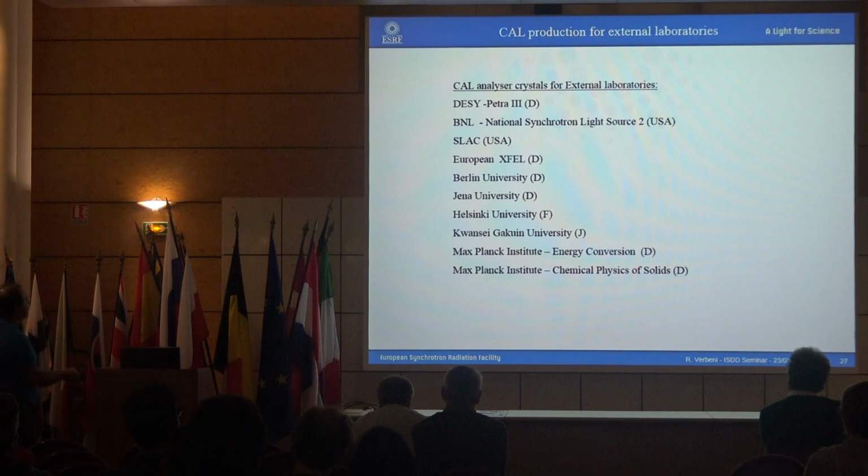This is a list of various synchrotrons, universities and facilities all over the world that asked the laboratory to produce analyzers. We work quite a lot with PETRA III. We did some analyzers for BNL.